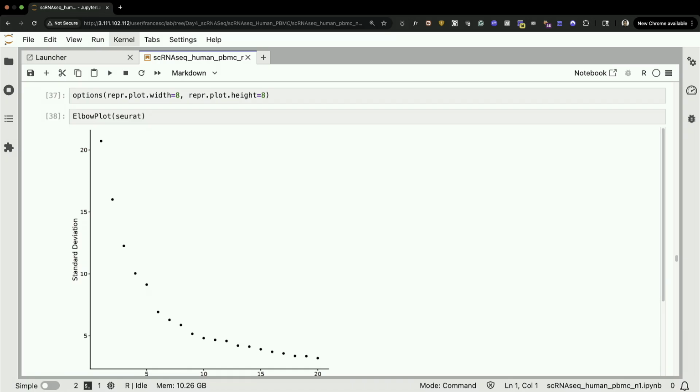I'm just going to keep going. So you have it on the screen now, the new elbow plot. It looks slightly different. If we needed to create a cutoff now, it's even harder. Maybe here, maybe here. At the end, it doesn't matter much because we are not going to make a decision based on the elbow plot.